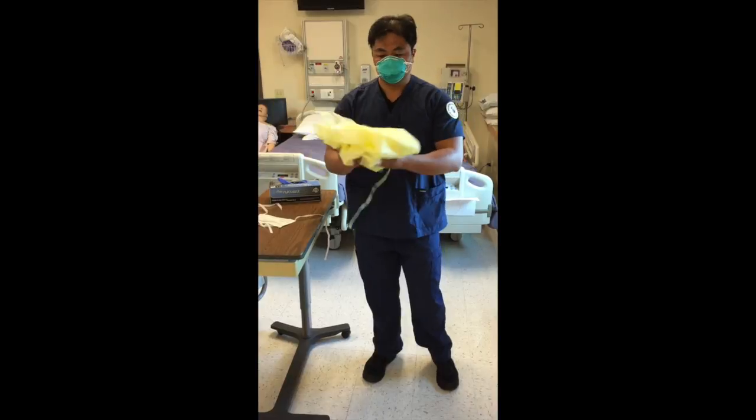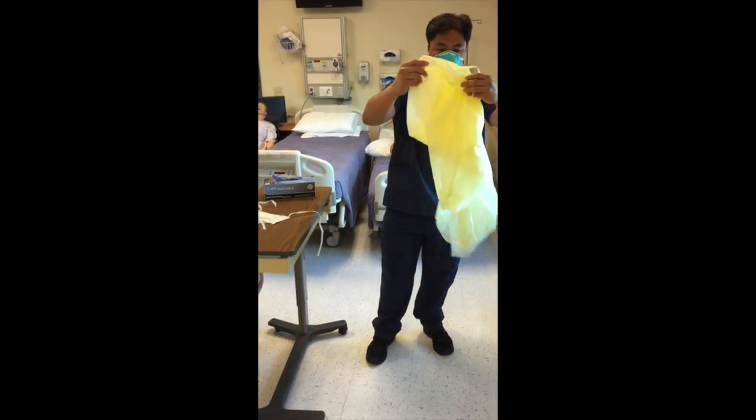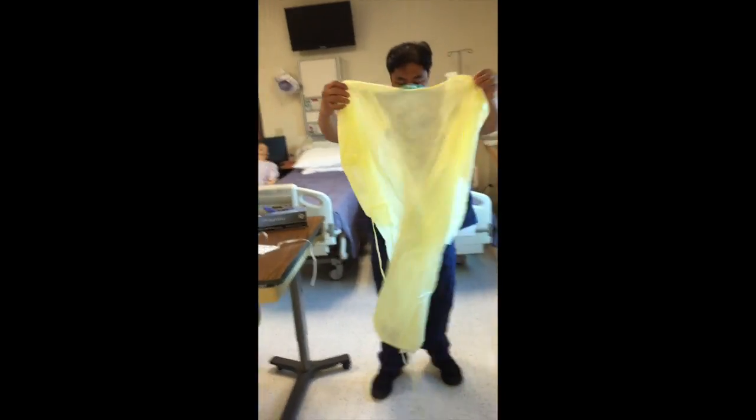Then you put on your gown. You want to make sure that you don't let the gown touch the ground. Let me put it in earthquake mode.